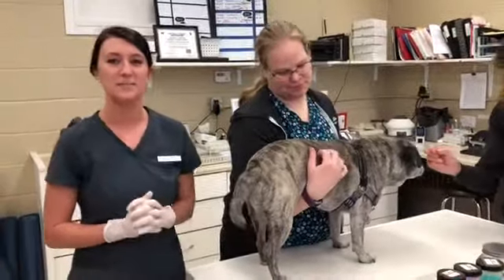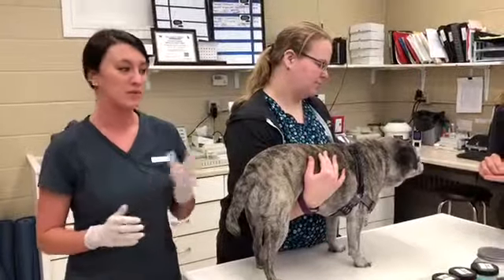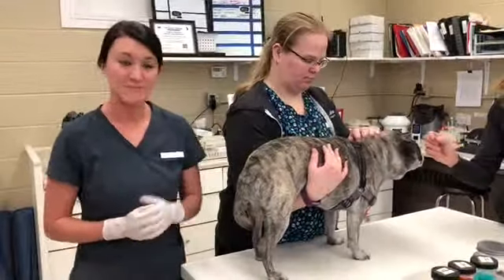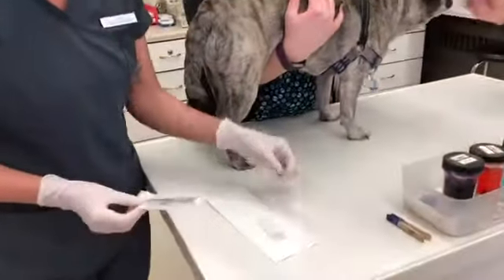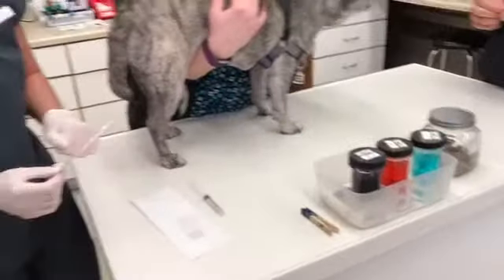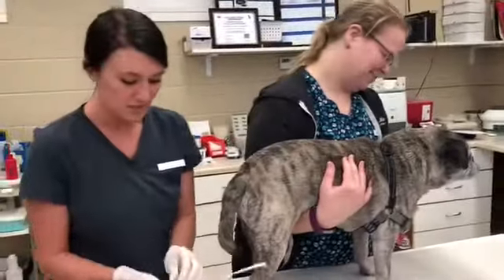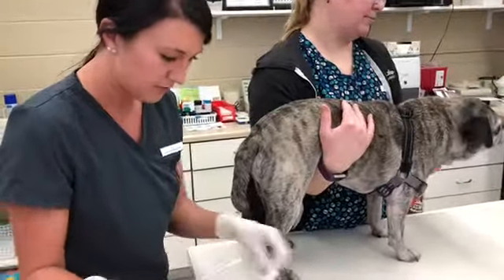Hi, this is Jessica Fox filming for VETT 222 task 13, which is collect, prepare, and evaluate a canine vaginal smear. I have my patient Jamie here, and I have these sterile swabs, some saline, a microscope slide, the Diff-Quick, and my distractor just feeding her treats. I'm going to open up the swab here and then pre-moisten it with some saline.